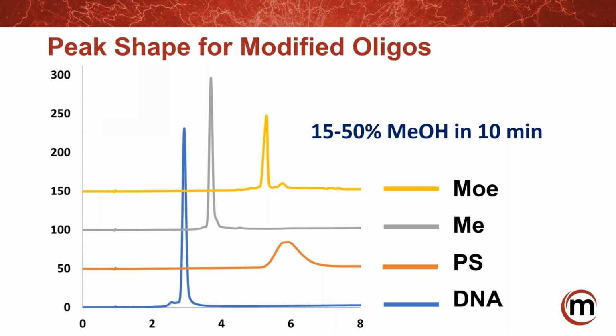The key point, I said I was going to come back to it. Why did we choose methanol? Acetonitrile is known in the literature to dampen pi-pi interactions. If you look at these single-stranded oligos with this backbone, you have a lot of pi-pi systems hanging out on one side of the oligo, depending on whether or not it moves and the way it sits out. But if it's open and it has that pi-pi interaction, you want to incentivize the column to deliver those pi-pi interactions for retention.